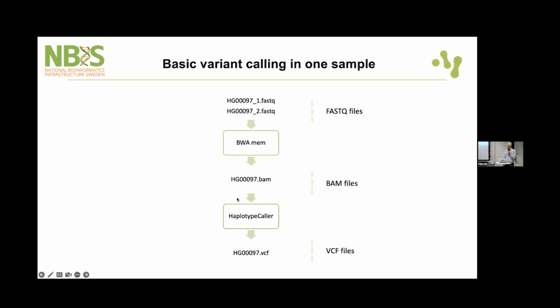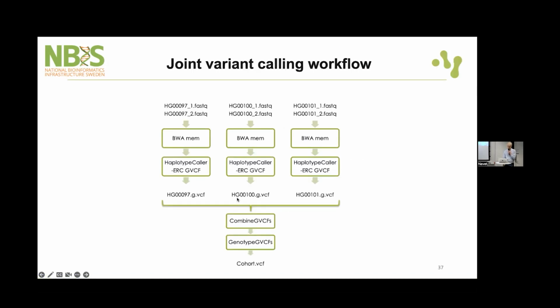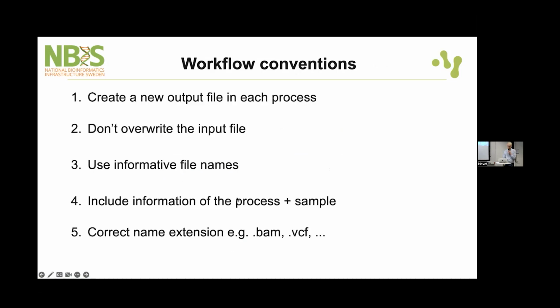So we will begin the exercise. We'll first make the basic variant calling workflow in part 2, which you will also have time to carry out today. We will extend that for multiple samples. And I would like to remind you to try to keep to these conventions to avoid forgetting what you have done in different files and so on.